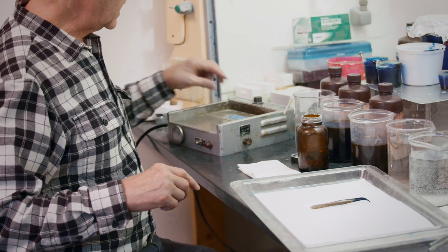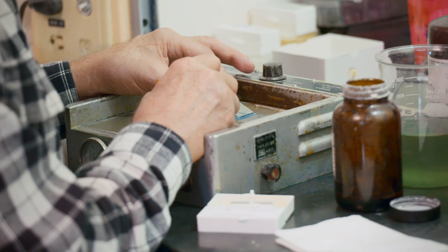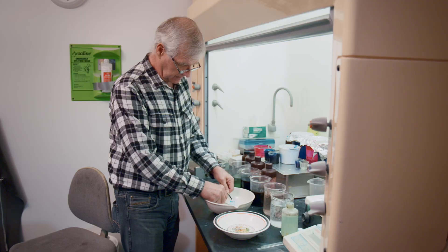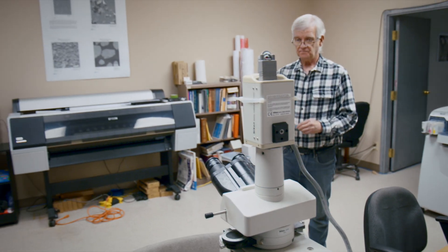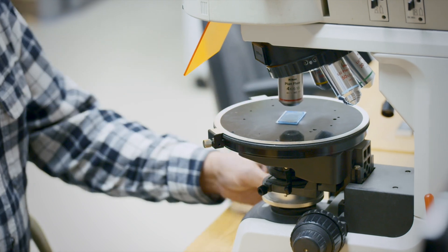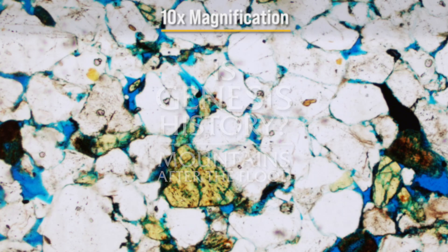Back in the day when we were really busy, we would do anywhere between 80 to 100 of these types of samples a day. Personally, I've probably done in the order of about 20,000. Now I'll take the slide and look at it under the petrographic microscope, which is a special kind of microscope made for analyzing geological thin sections.